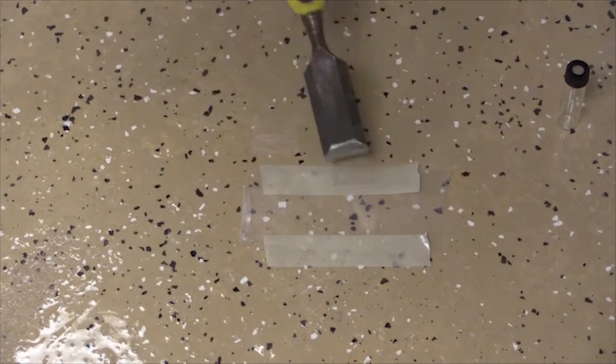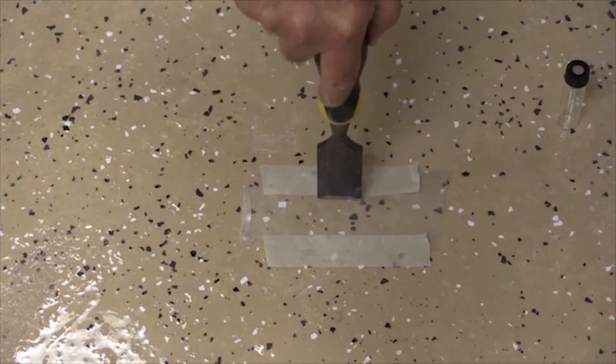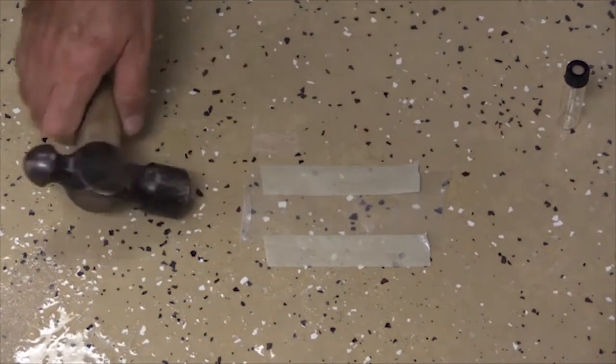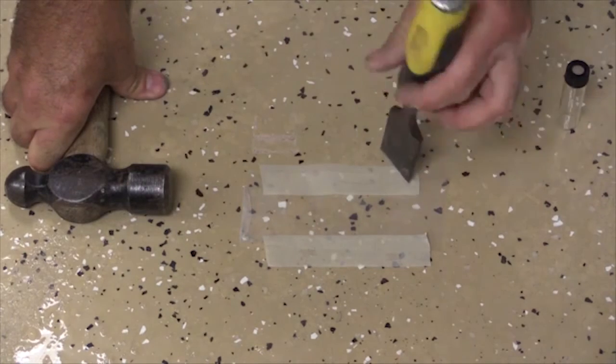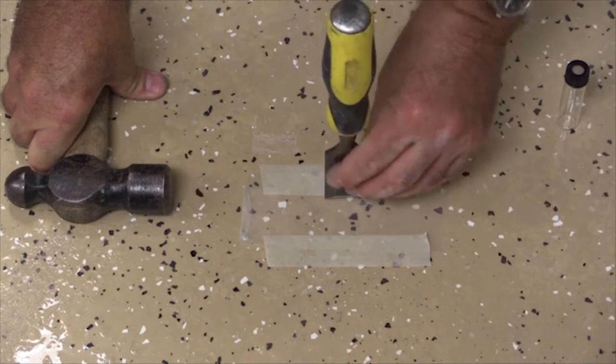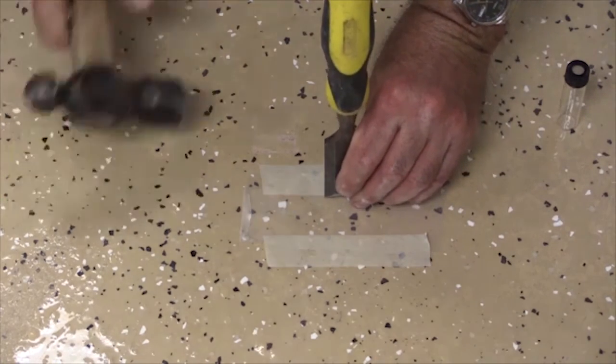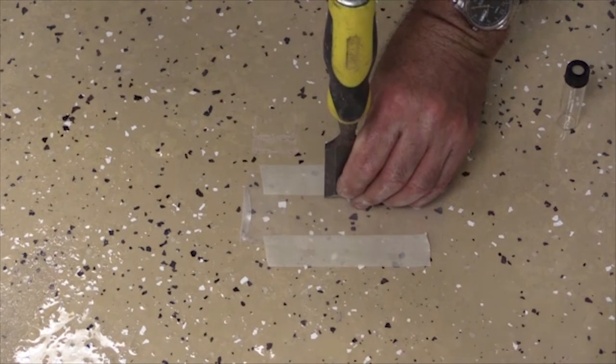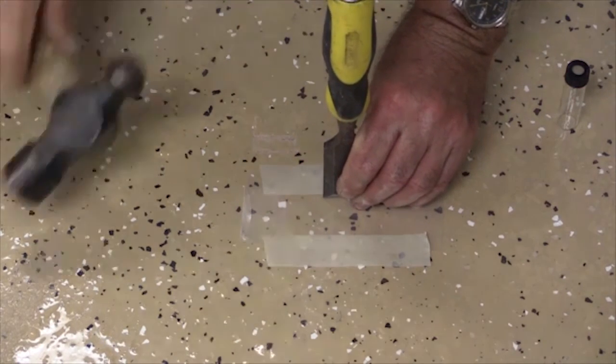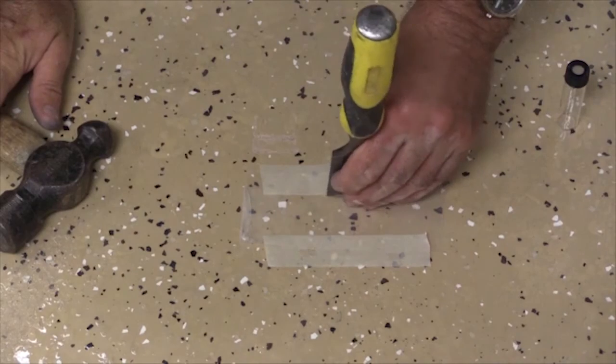So now what we can do is we can take our sample in the area that we want to right through our plastic. So what I'm going to do is take the chisel and hold it at a slight angle so I can cut through the coating, and make sure that I've cut through the system.